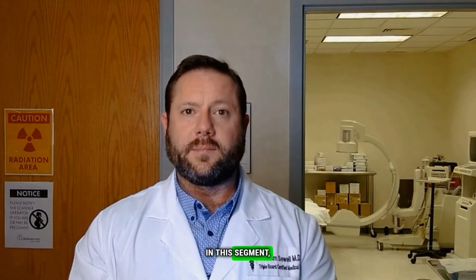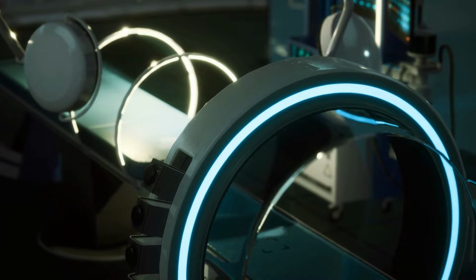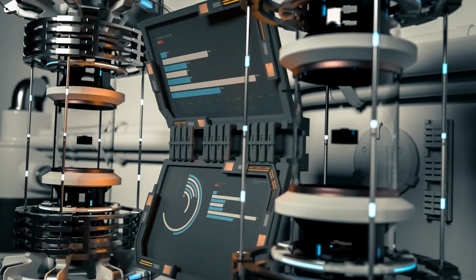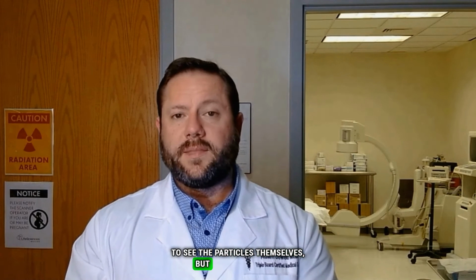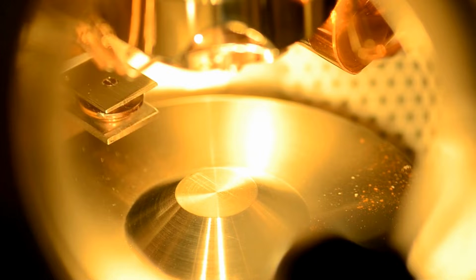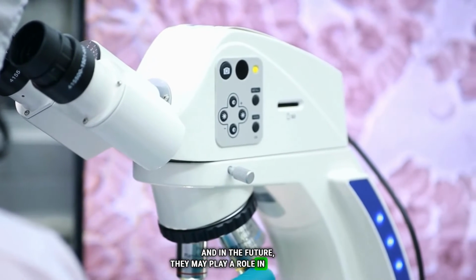In this segment, we're going to look at something critically important for the future of clinical diagnostics: imaging and biophysical tools that may soon allow us to directly visualize or detect microplastic particles in human tissues. While laboratory testing gives us biochemical markers of exposure and toxicity, it doesn't yet give us a way to see the particles themselves, but that's changing. Emerging technologies in spectroscopy and microscopy are now being adapted for clinical research, and in the future, they may play a role in standard diagnostics for environmental medicine.